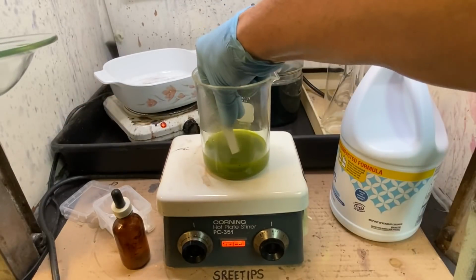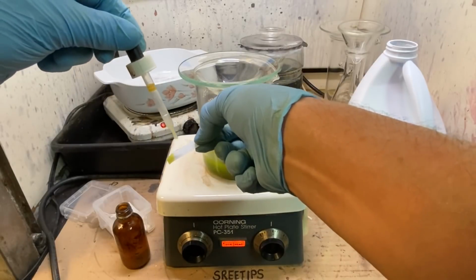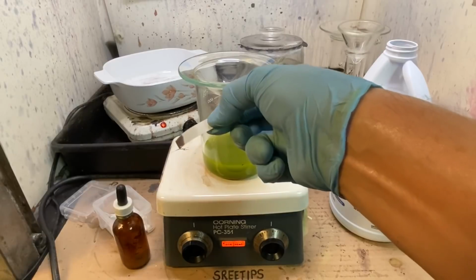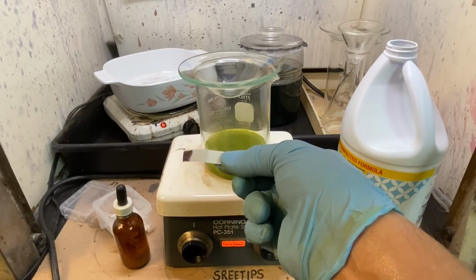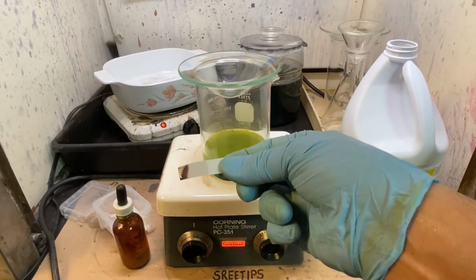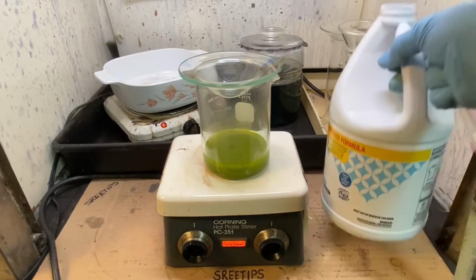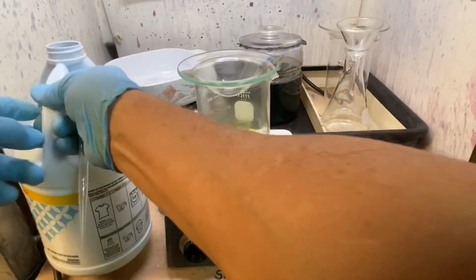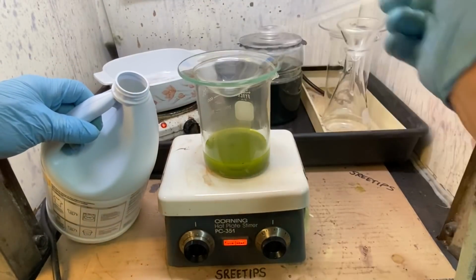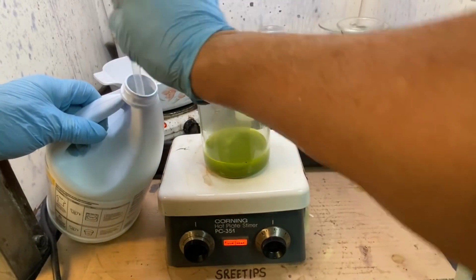I'm going to reach in here and get a little bit more on another piece of filter paper and see if we've got any gold going in solution yet. Ooh, look at that. Right off the bat, I just added that bleach not more than 60 seconds ago, and we're already putting gold in solution. All right, I'm going to add some more bleach here. But instead of pouring it in, I'm going to get it up in a pipette here and add it this way. A lot less messy.